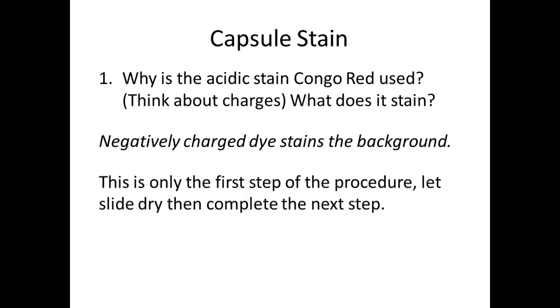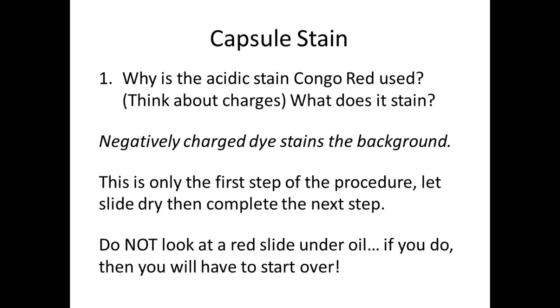That's only the first step. Do not let anybody look at a slide today that's red under the microscope, because once you put that oil on, it's ruined and you've got to start over. You're not going to see the capsule if you stop there.